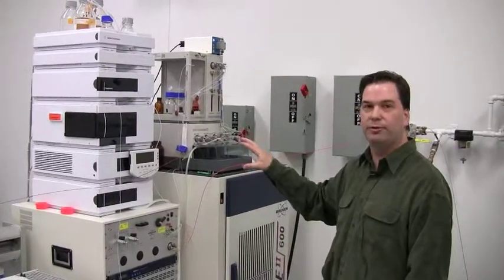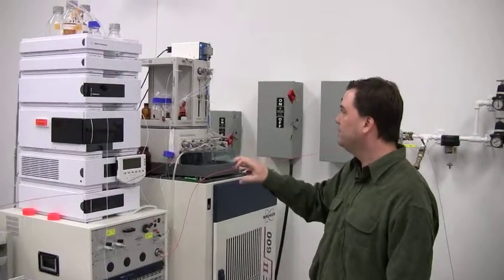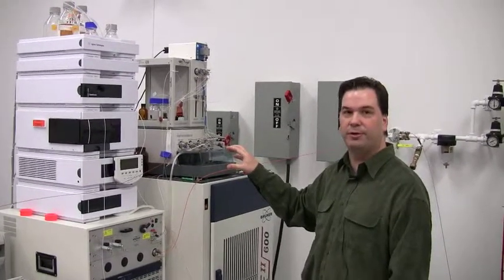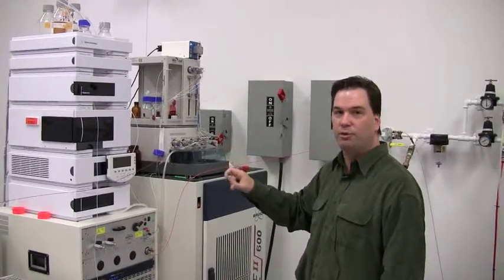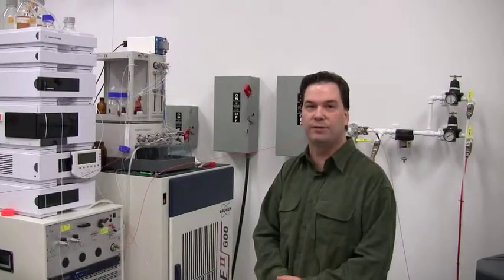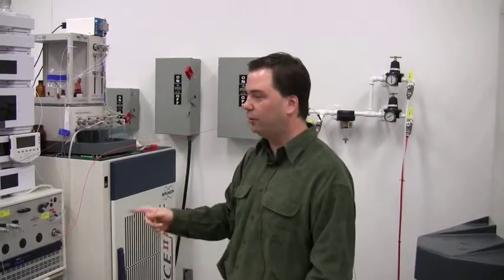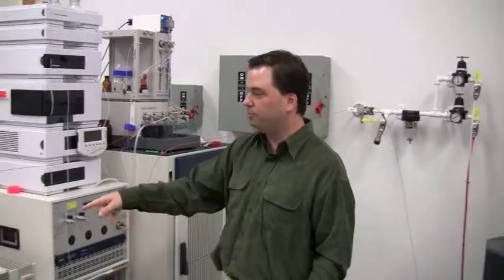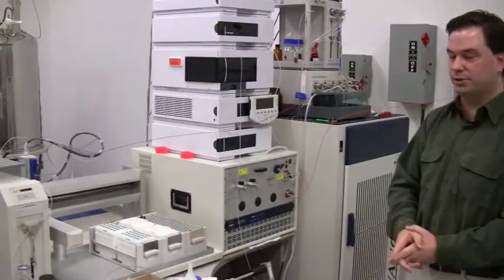Once we trap the material on the solid phase extraction cartridges, we could dry the cartridges down and remove the source of protonated solvents. Then we could elute them with a very small amount of deuterated solvent either directly to the NMR via our flow cell, or we could actually send it over and load NMR tubes using the Gilson sample handler.